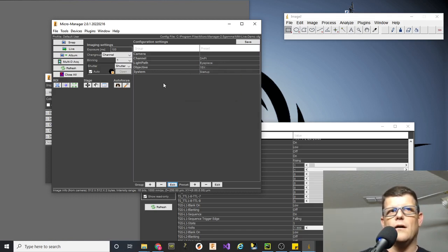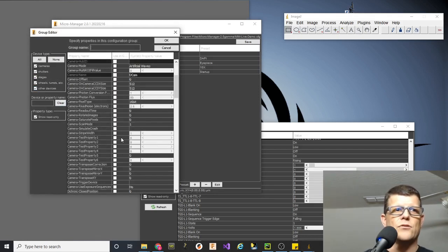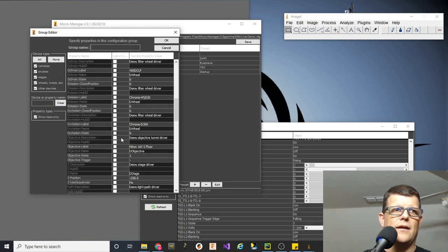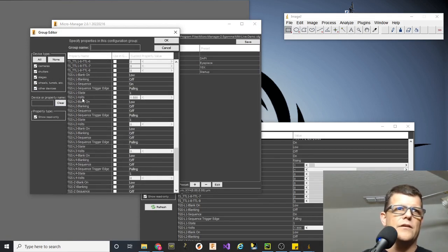So if I want to just keep the laser powers the same through the duration of my experiment, which most people want to do, and only trigger on or off a laser based on the TTL output, then I still want to have control over the lasers, so where do I put them? So here I'm going to put them in the main group area, and I'm just going to choose one laser at a time. So I'll go down, and we'll scroll to, all right, here's laser 1.